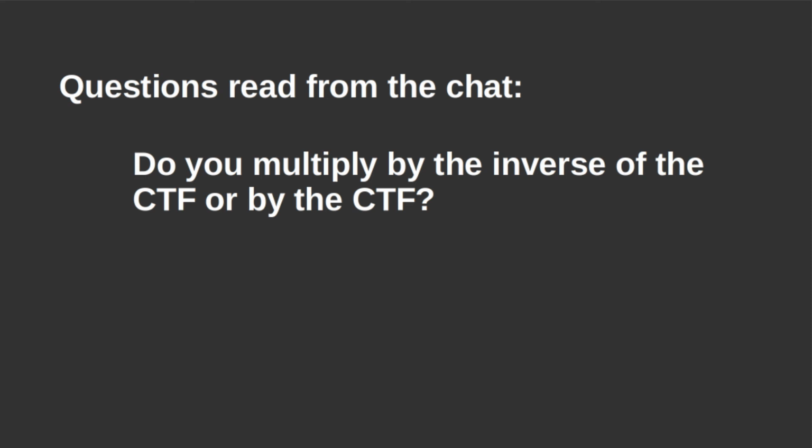Now I'm not sure if I understand the question correctly, but yes. One of the problems that we have, or it's generally not solved, is that you get this 2D image that is a representation of your 3D thing, and you do not know where the defocus was estimated. Typically we take it as the center of your density.